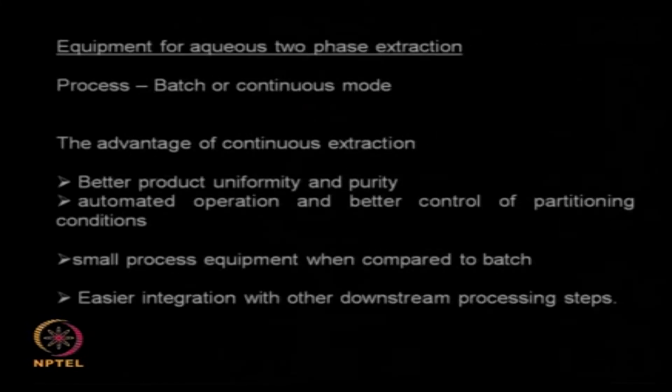So, why does that happen? It is almost like a salting out effect. You are adding a larger molecular weight material, so the protein leaves the system and goes to the other phase.